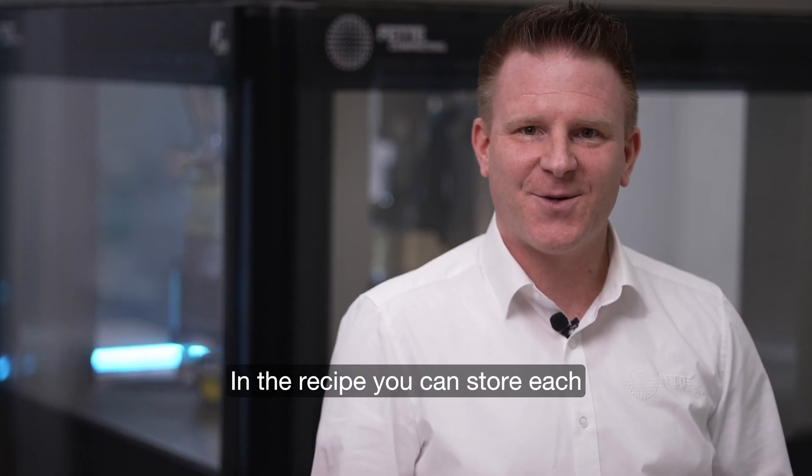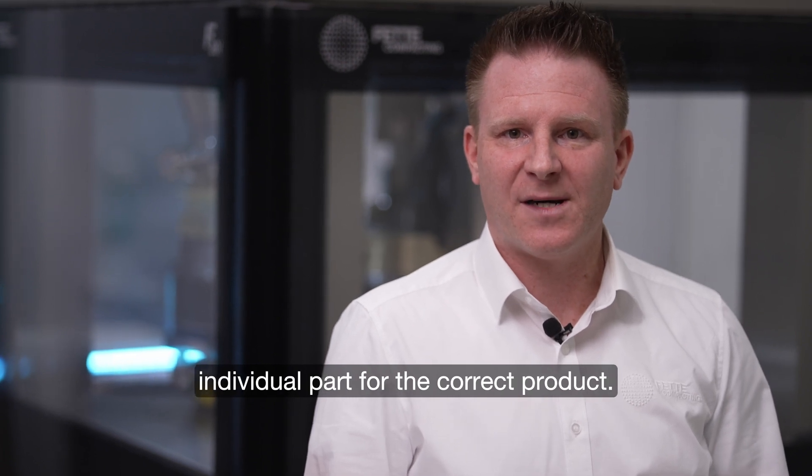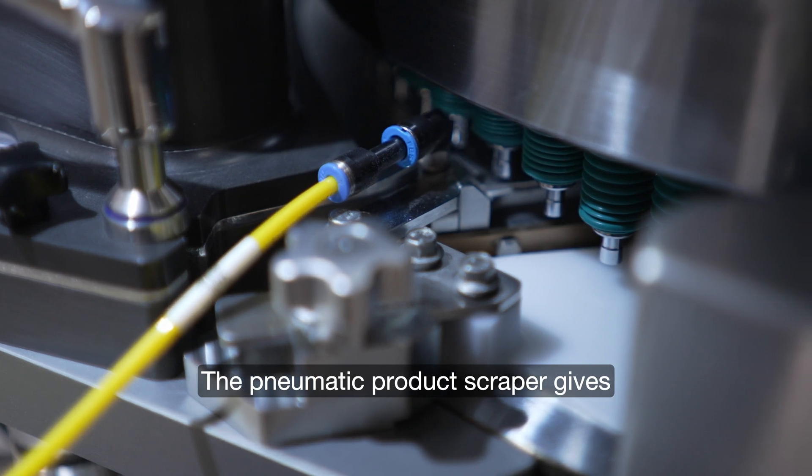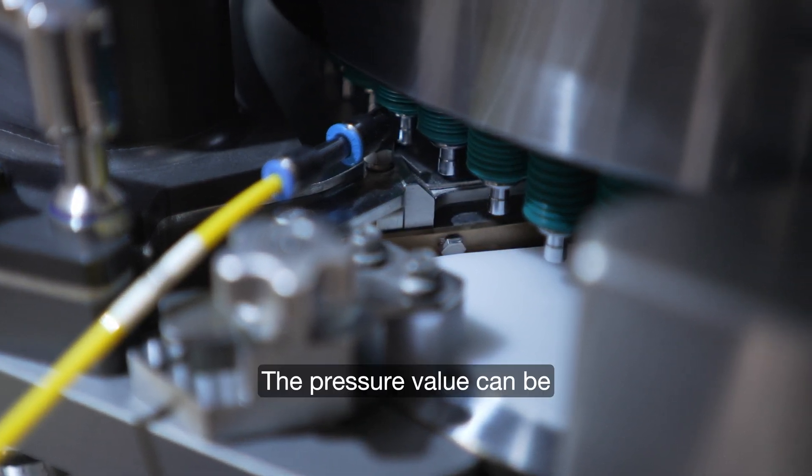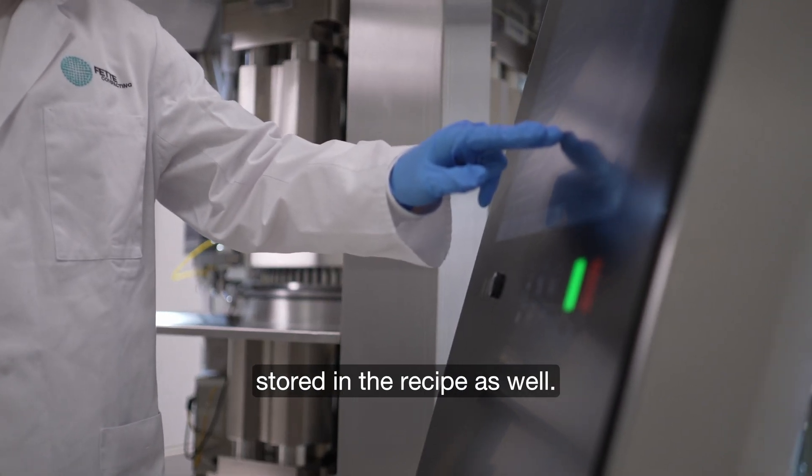In the recipe you can store each individual part for the correct product. The pneumatic product scraper gives sufficient pressure on the die table, and the pressure value can be stored in the recipe as well.